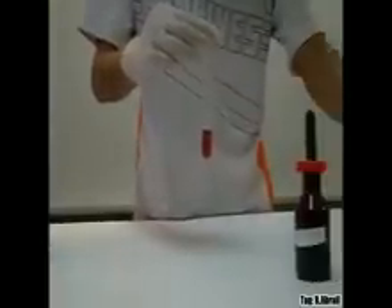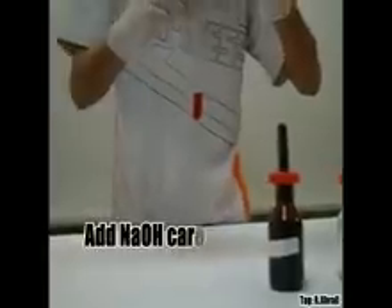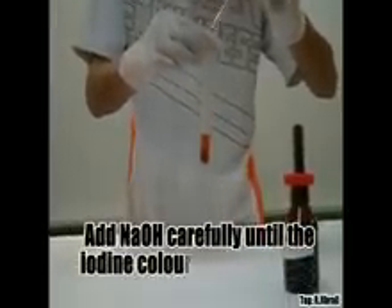This is aqueous sodium hydroxide, NaOH. Add NaOH carefully until the iodine colour has just almost discharged.